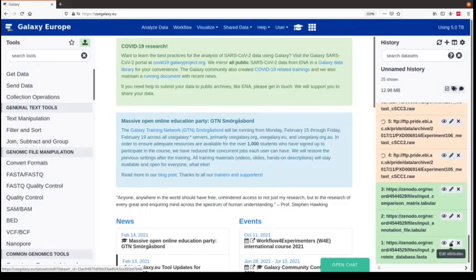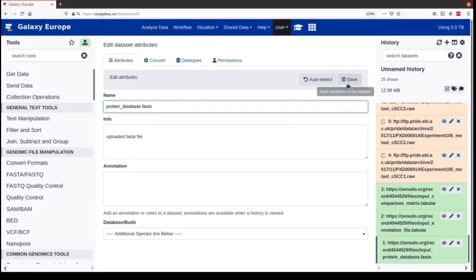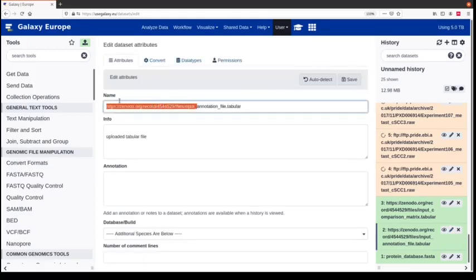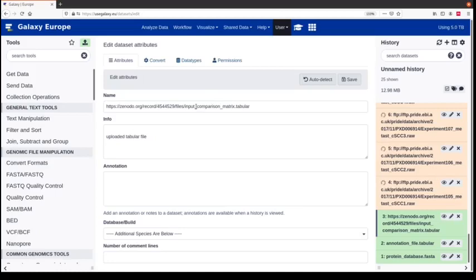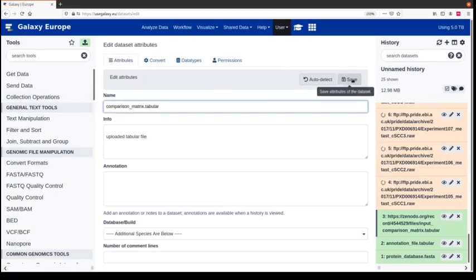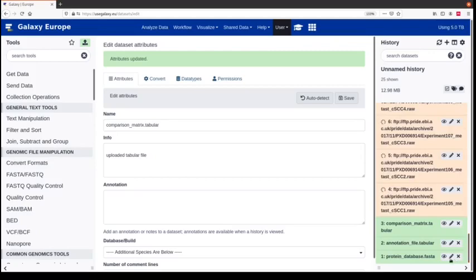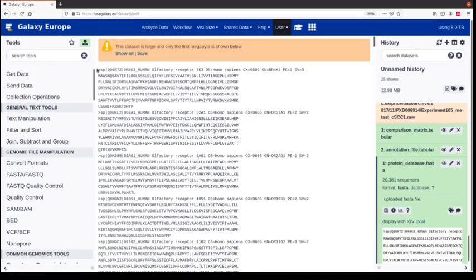Because of the Zenodo link, the files now have a weird name, so I will rename every one of them. To do so, I click on the pencil and remove the beginning of the file name. So we have here a protein database, an annotation file that we need for MSStats, and a comparison matrix that we need for MSStats. The raw files will take quite a while to load, so we can already look at these files here.